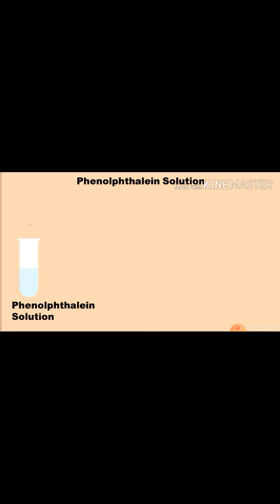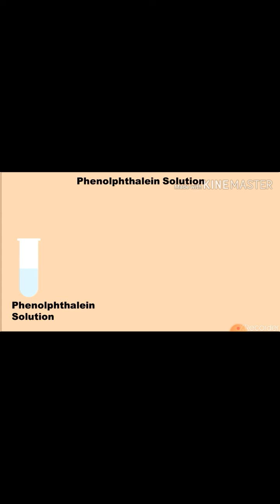Let's see how phenolphthalein solution is used as an indicator. Take a test tube half-filled with phenolphthalein solution. Pour few drops of acid into the phenolphthalein solution. No color change takes place. In the presence of acid, phenolphthalein remains colorless.